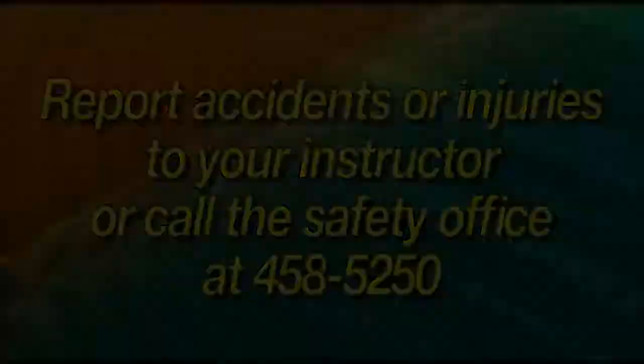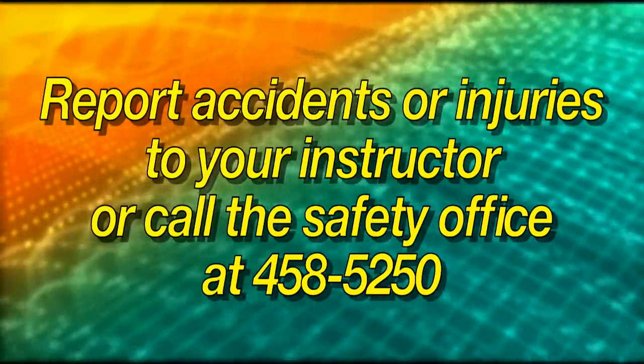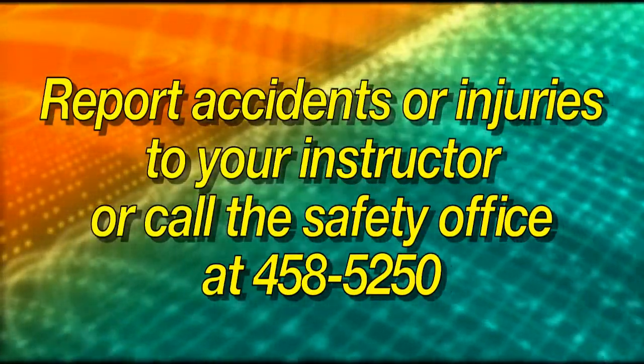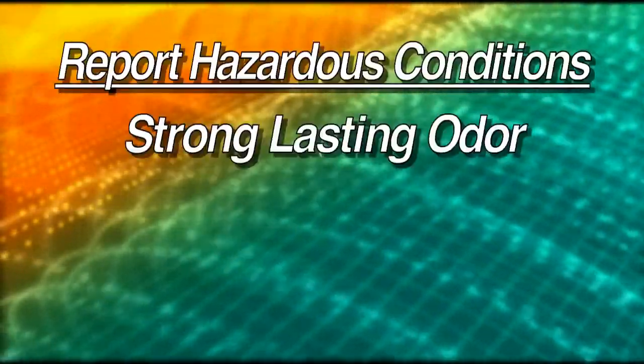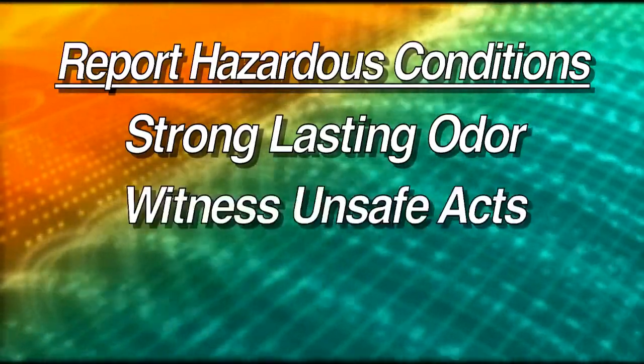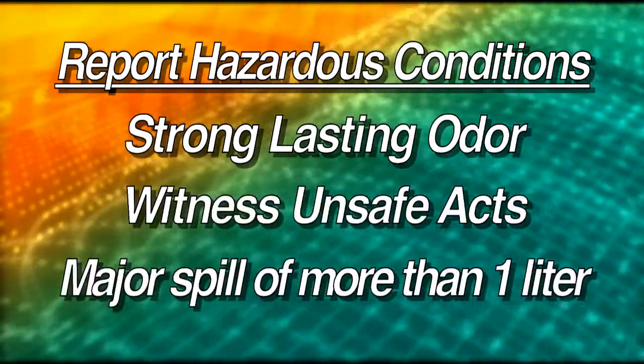Finally, do not hesitate to speak with your instructor or call the safety office at 458-5250 to report an accident or injury. If you notice a strong, lasting odor, if you witness an unsafe act, or if a major spill of more than 1 liter occurs in any work environment.